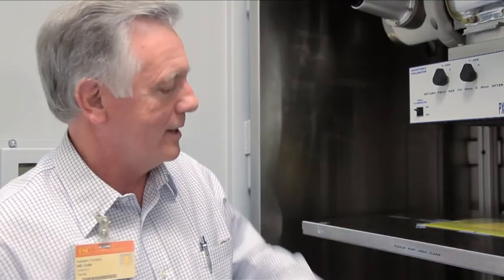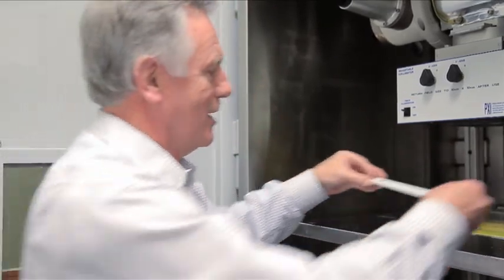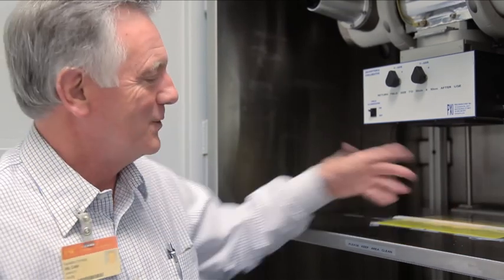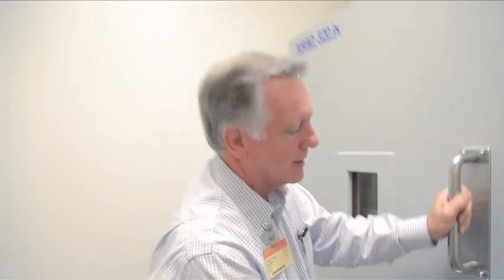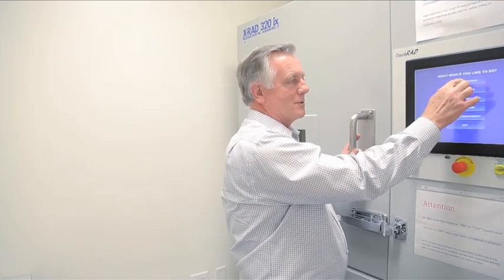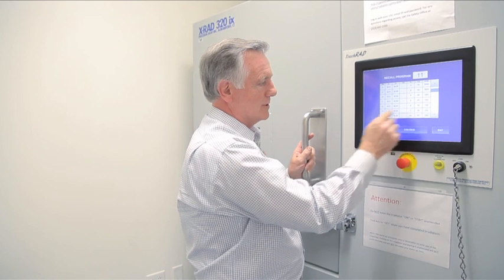Once all of that is ready and you put your sample in so that it fits within the field, you close the door. When you go back to the computer and go back into recall programs, you call back a program that's more typical for your use.